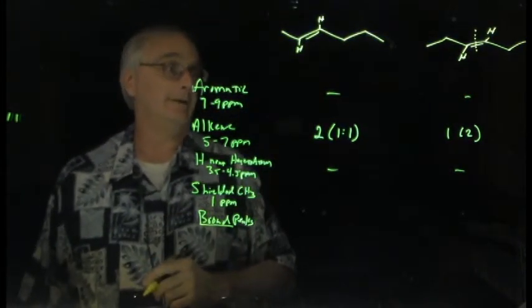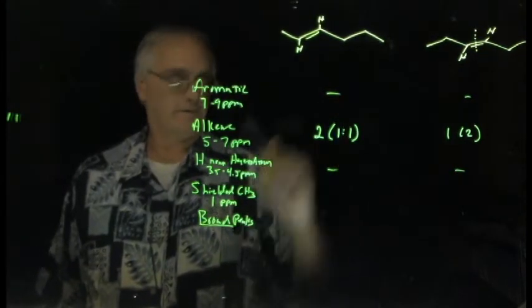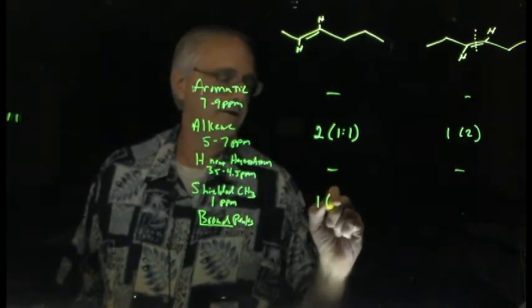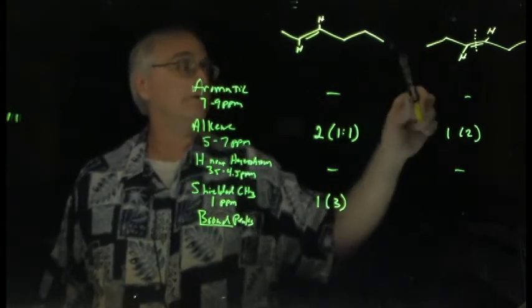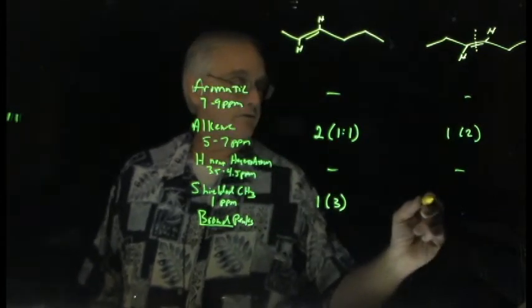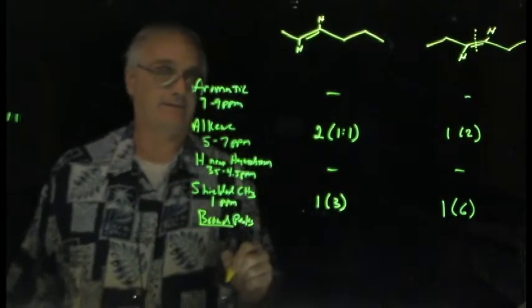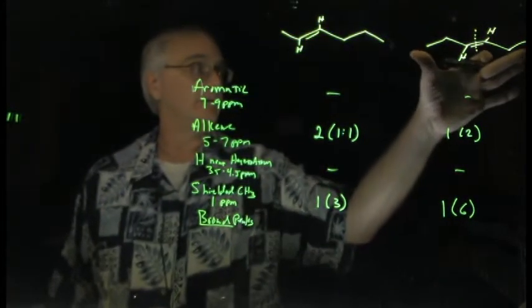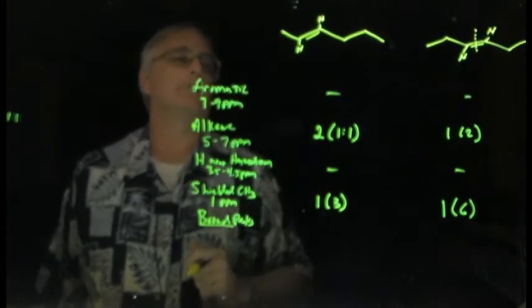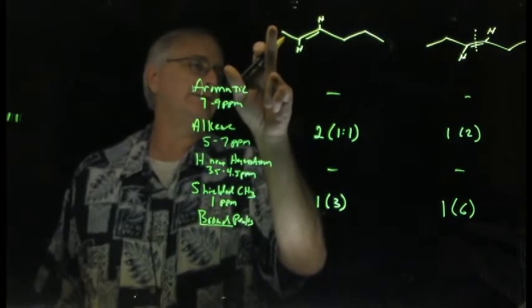Shielded methyl groups. Yep, there are shielded methyl groups here. Here's a methyl group at the end of a long chain. Okay, so there's 1 that would integrate to 3. Now, this one also has hydrogens at the end of a chain. This one should have 1 signal, but integrating to 6. Okay, again, because of the symmetry. These 2 are going to be identical to each other. This methyl group back here on this molecule, again, it is not at the end of a chain.